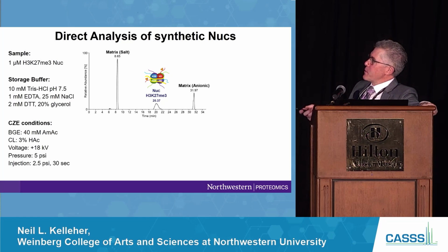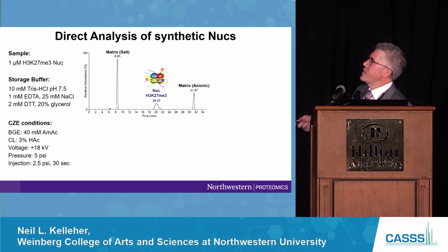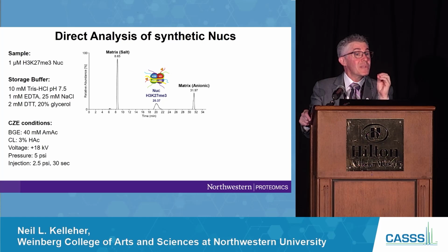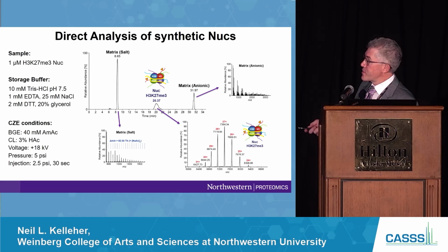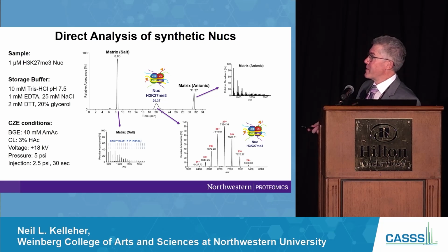Anionic separation, there's the salt that comes out, and the nucleosomes are beautifully clean. It separates them out from all those small molecule charge contaminants. Of course, it's electrophoresis, right? And then the sensitivity of the Cesi 8000, if you probably know, the flow rate is exquisitely low out of this thing, and it elevates the sensitivity for intact analysis. And the desolvation's beautiful. I was very impressed by this.